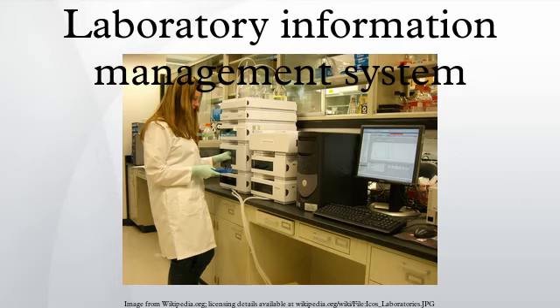The processing could then include a step where the sample container is registered and sent to the customer for the sample to be taken and then returned to the lab. The registration process may involve accessioning the sample and producing barcodes to affix to the sample container. Various other parameters such as clinical or phenotypic information corresponding with the sample are also often recorded. The LIMS then tracks chain of custody as well as sample location.